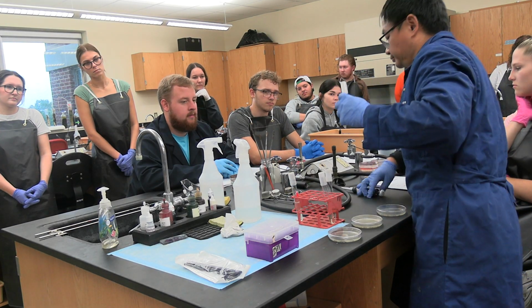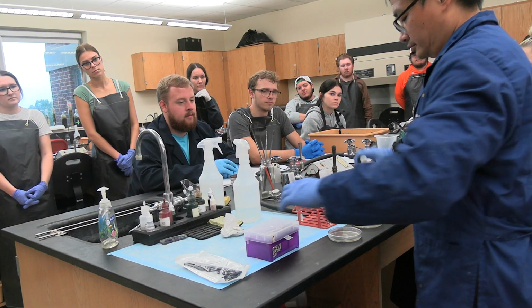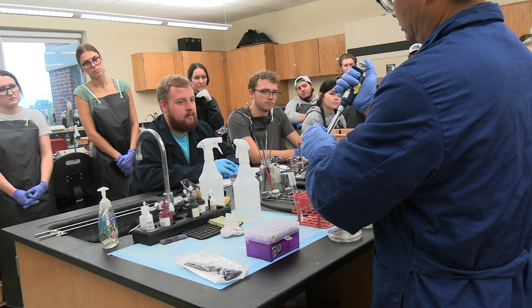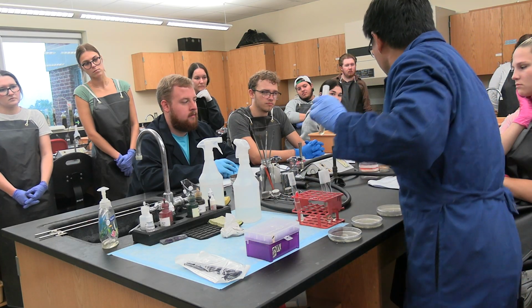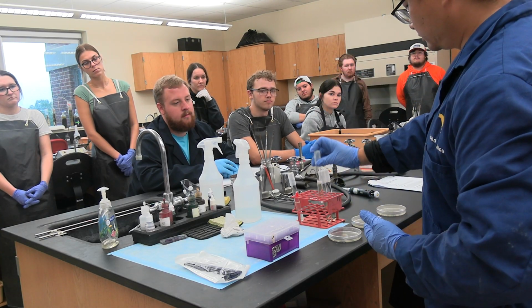Switch it. Shake 15 seconds. Then the last one. And shake 15 seconds. That's ready.